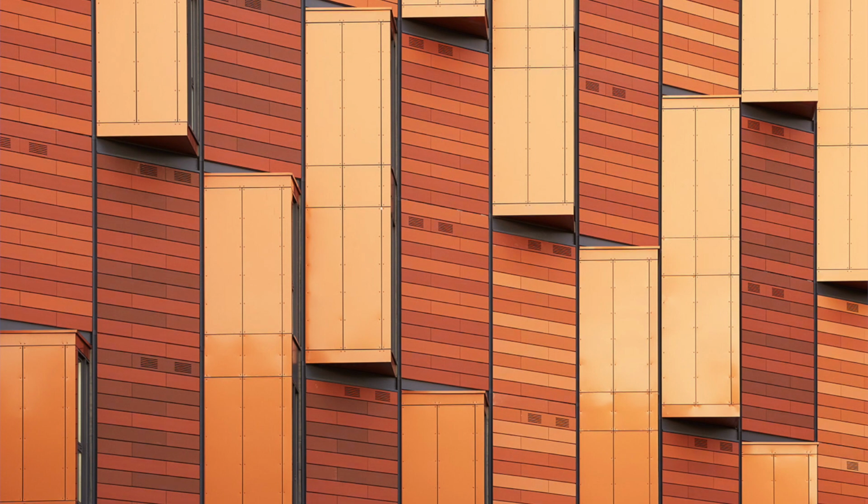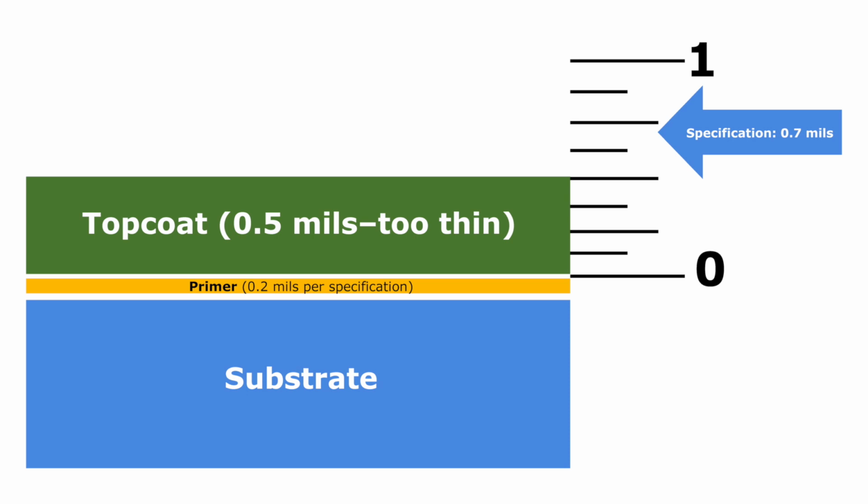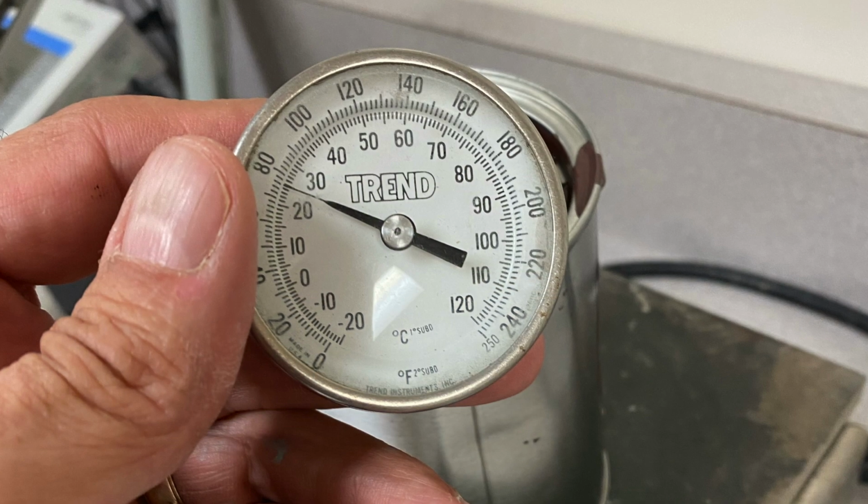Viscosity that is too high could produce ropey flow on a coil coating line. Viscosity that is too low may lead to inadequate dry film build. For these reasons, manufacturers of coatings formulate their product to run within a narrow viscosity range. Viscosity is affected by temperature, and a narrow temperature range is also specified when testing for the viscosity of a coating.